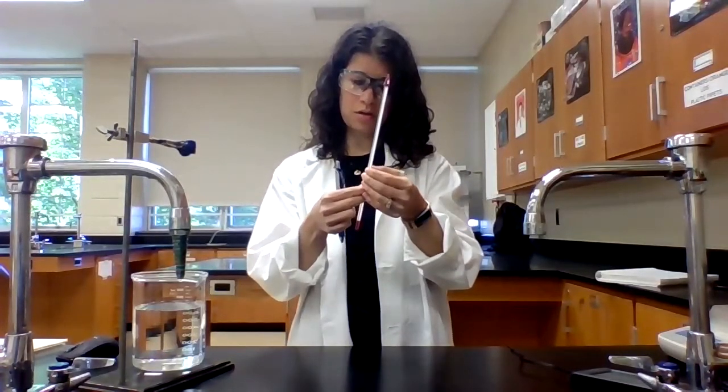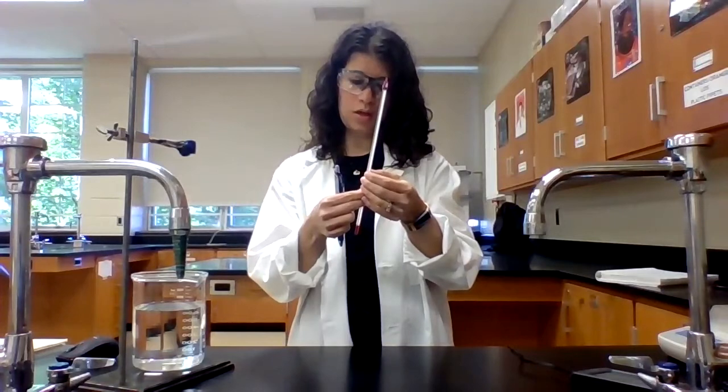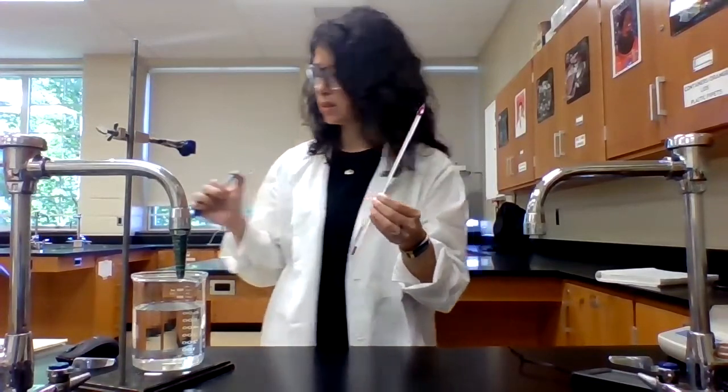We also need to know the temperature of the room. So I'm just going to take a thermometer and read the temperature here. It's reading 20.8 degrees Celsius.